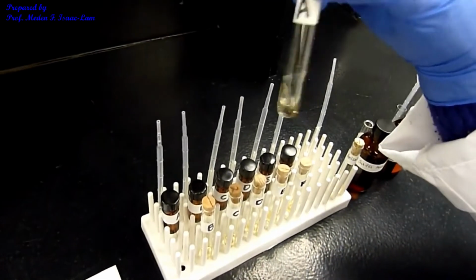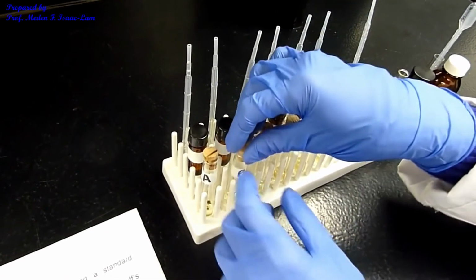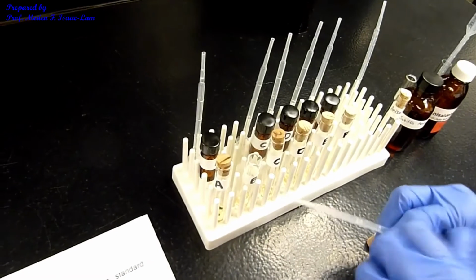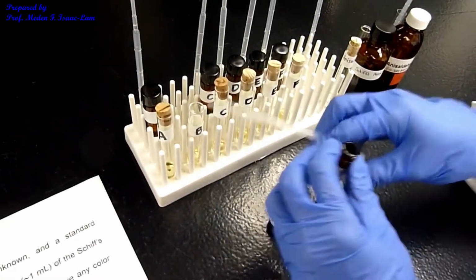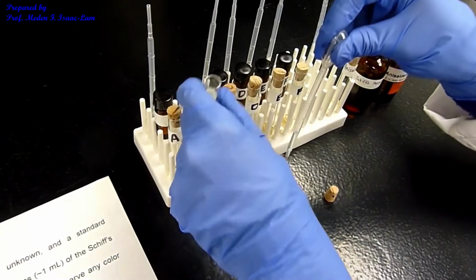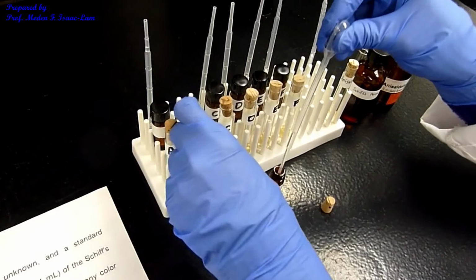And then shake it. And then unknown B. One drop.